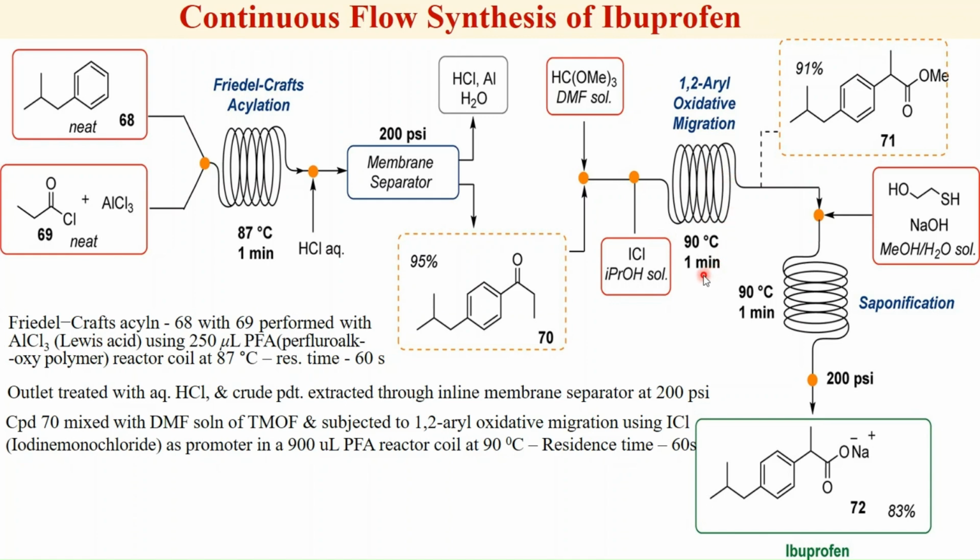The reaction time is just 60 seconds. The 1,2 aryl migration occurred to give the ester form of ibuprofen in 91% yield.